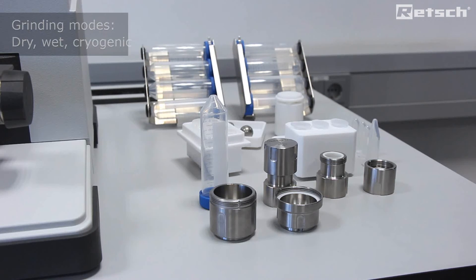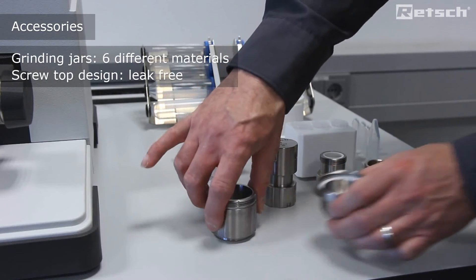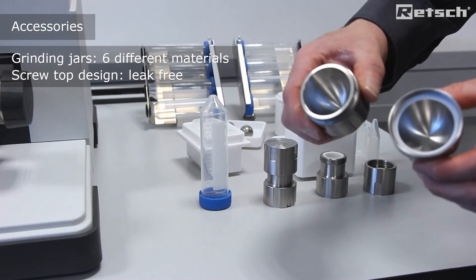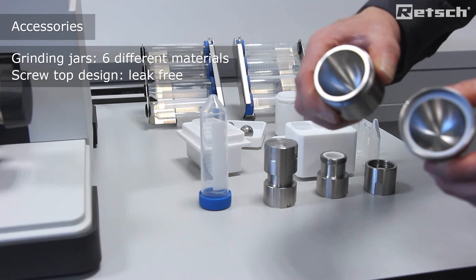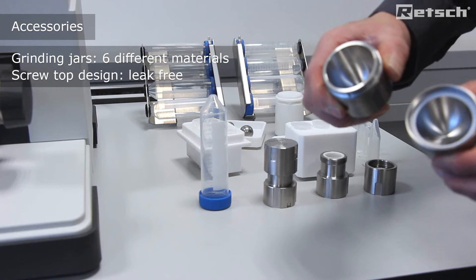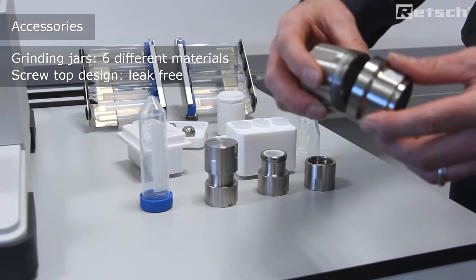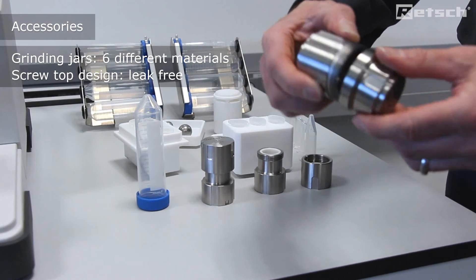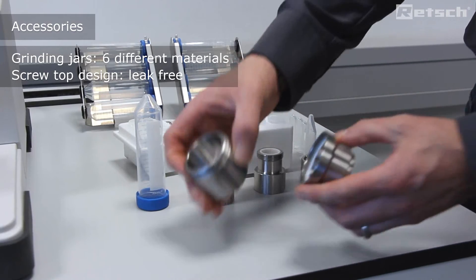We supply and offer a very wide range of accessories to facilitate many application areas. These include grinding jars which are available in different materials for preserving the sample neutrality during preparation. Here we can see the grinding jars with the lid and the barrel, whereby we see a screw top design. This allows for leak-free preparation both wet and dry.